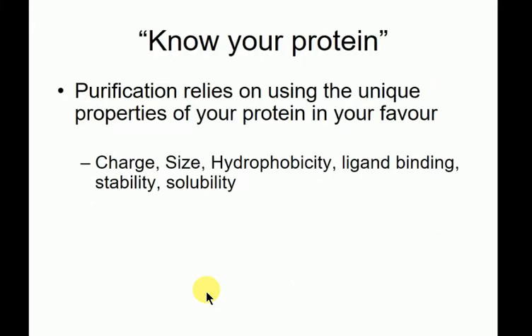So you can predict, you can't always feel that your prediction is going to be 100% correct, but you can pretty much predict charge, size. Hydrophobicity is a difficult one to predict. Ligand binding, if you know the role of your protein, you usually can't predict stability or solubility.